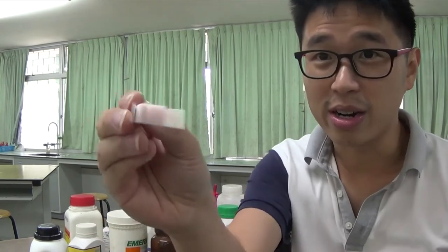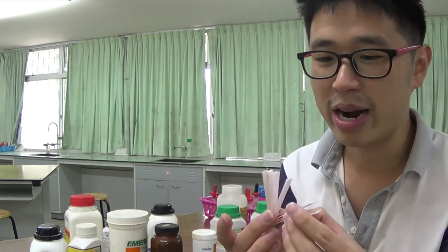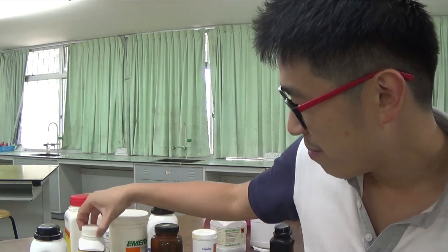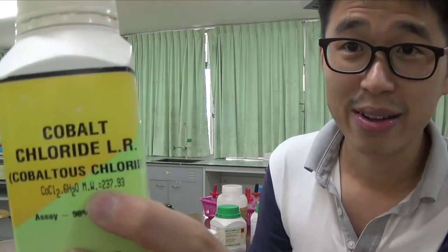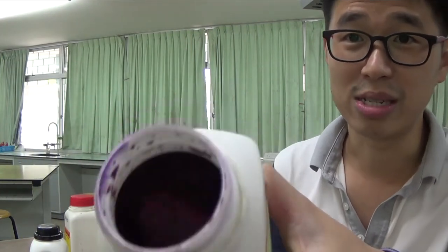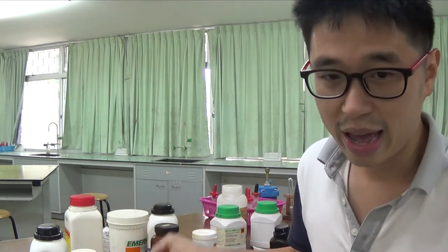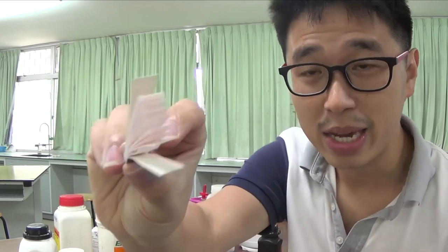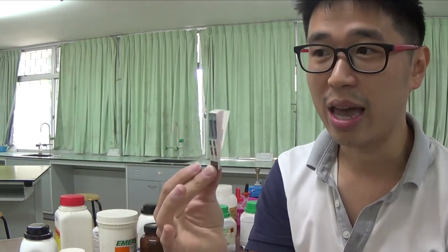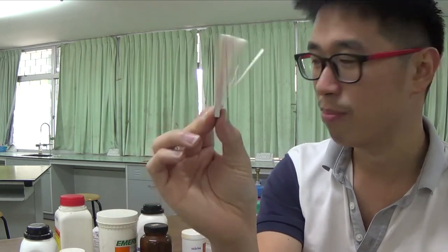These are not very good cobalt chloride papers anymore because of the hydrated cobalt chloride, remember? Cobalt chloride with the water, H2O. It was this color. So this is already a very old sample, the test paper. That's why you have this turning pink, because the water vapor in the air already turned all the supposedly blue, should have been blue.